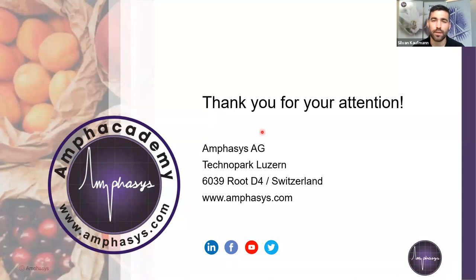That's maybe another important hint. We have a certain measurement mode that allows you to measure a particular volume of sample and gives you a very accurate indication of cell concentration, for instance, or a total cell count in a sample. And counting mode templates, by the way, can be downloaded on the website. So again, don't waste any time from the collection of those stigmas to the measurement, because you don't want the pollen tubes to grow.